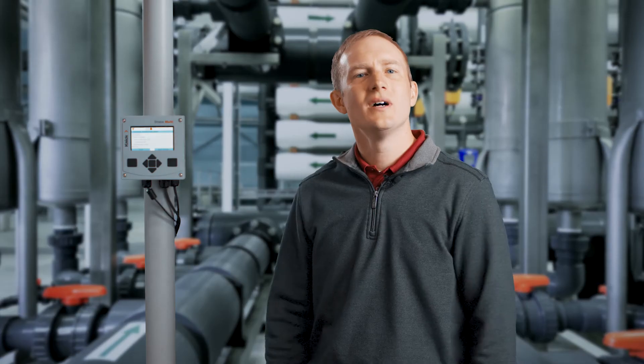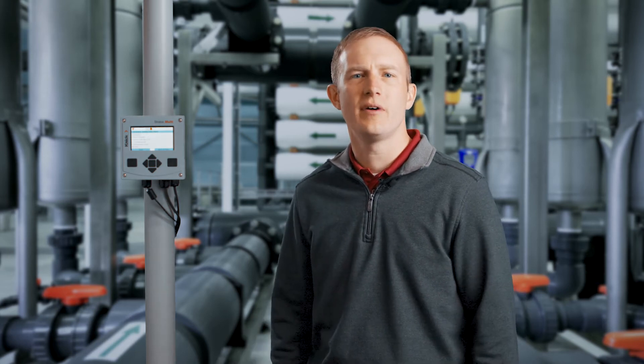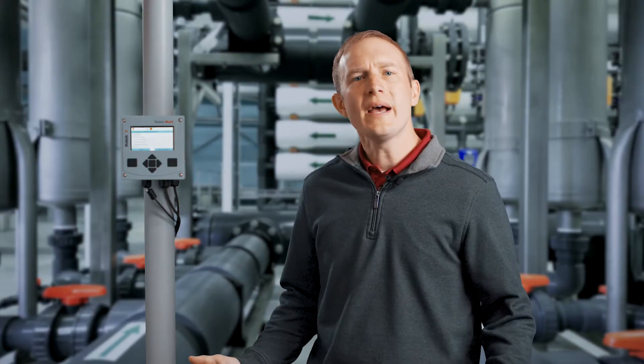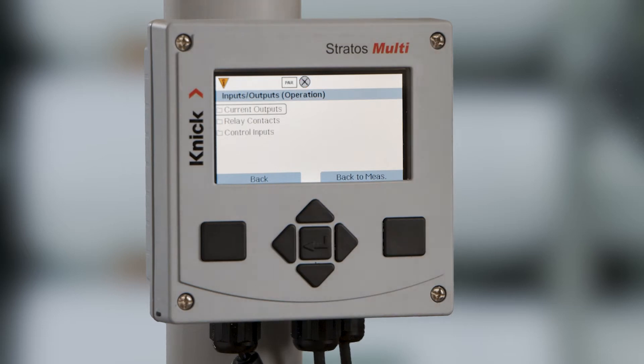Now, let's configure the 4 to 20 milliamp outputs and the relays from the device. If utilizing any digital inputs for flow control or placing the transmitter in hold mode, they can also be configured within this menu. Scroll down to inputs/outputs and press enter.